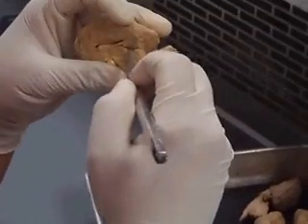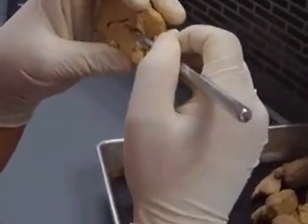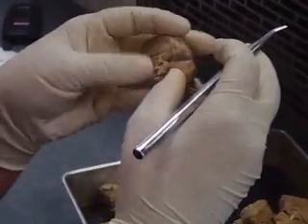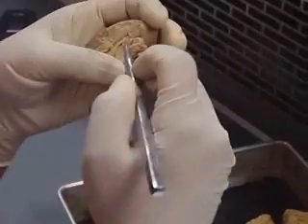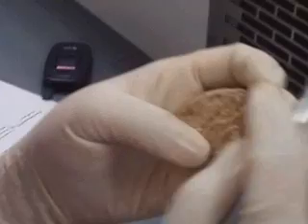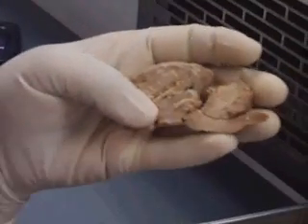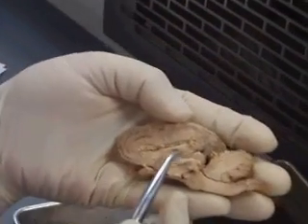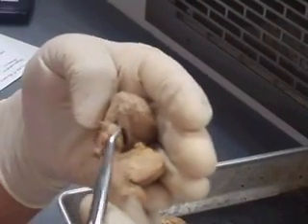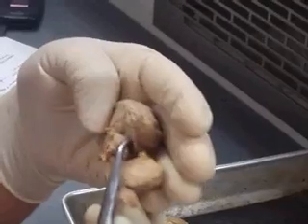It's actually been a little bit removed here. It's usually a better structure. I think it's been popped out of a couple of these. See how there's actually a structure right there? That's your pineal body, behind your superior colliculi. Pineal body, superior colliculi, inferior colliculi, part of the corpora quadrigemina.